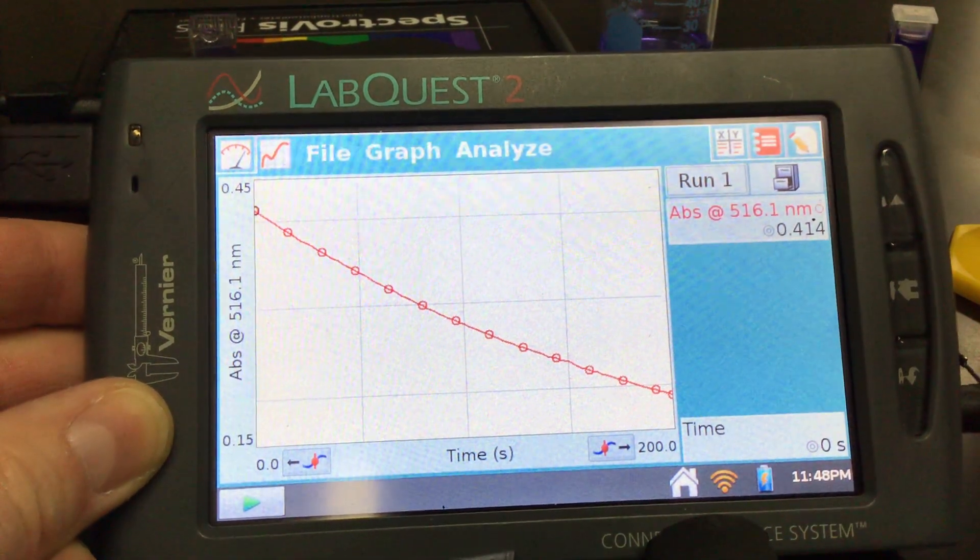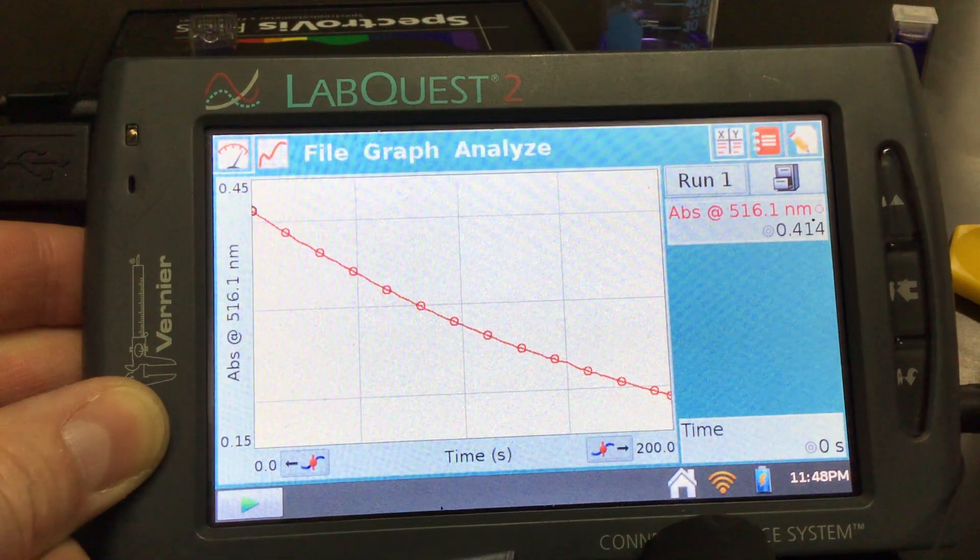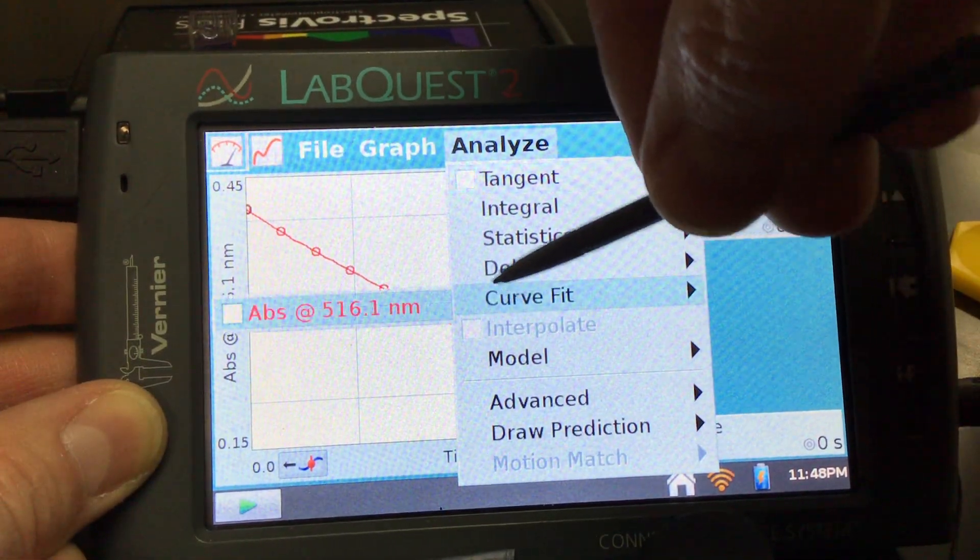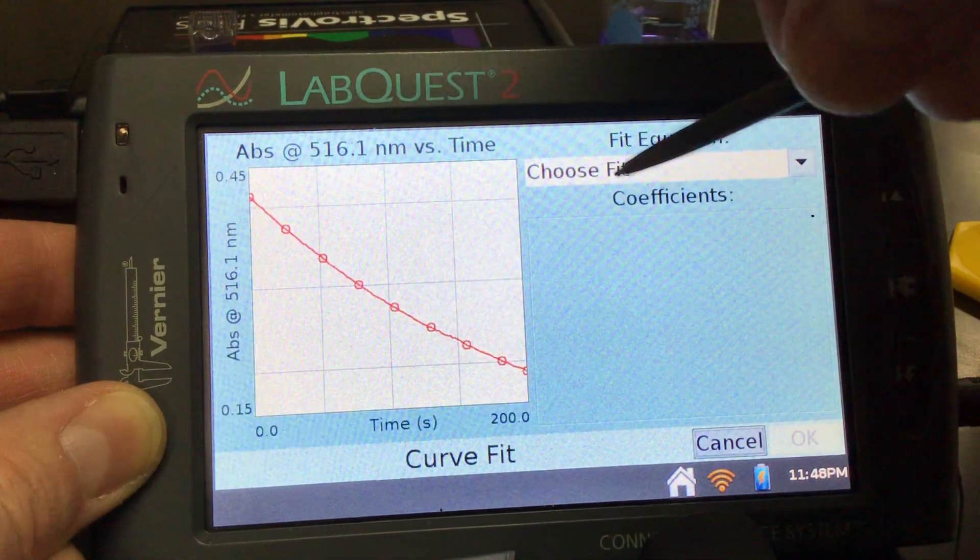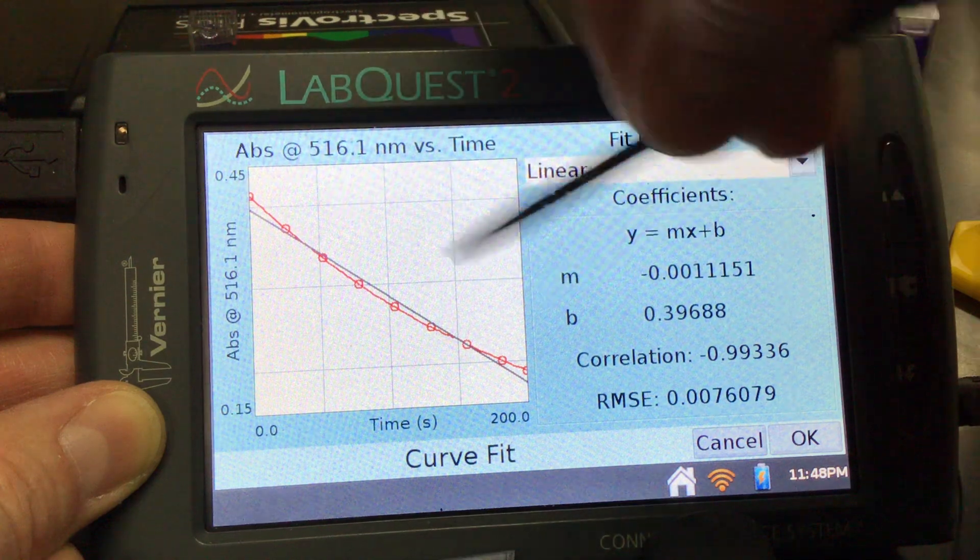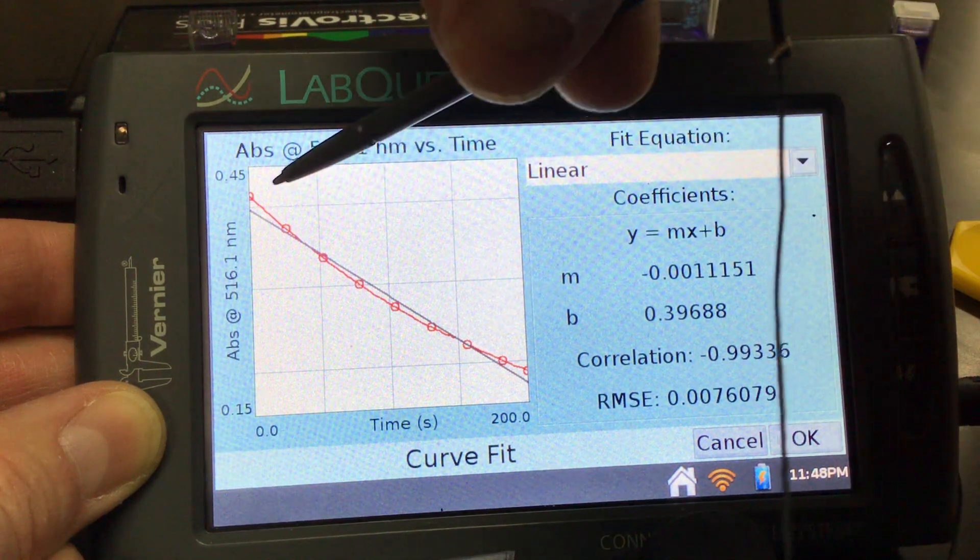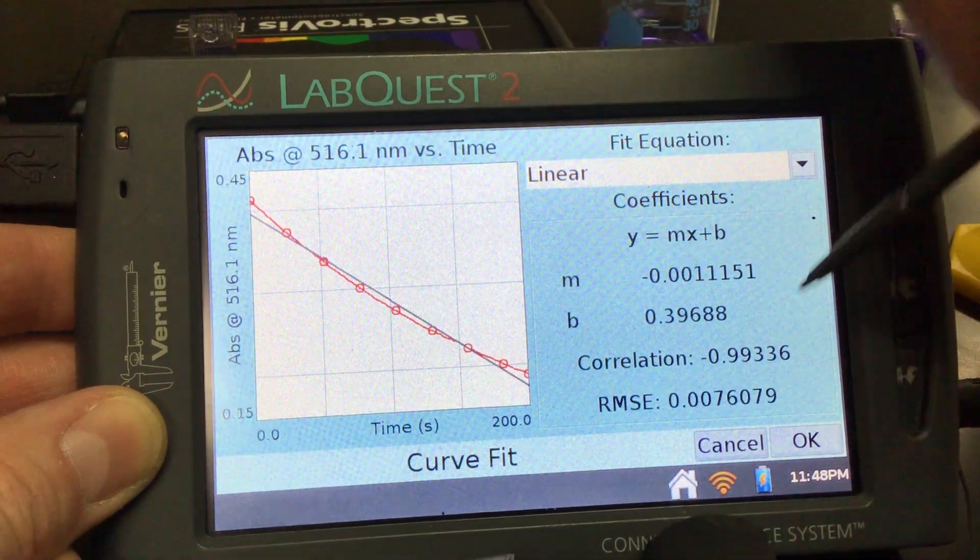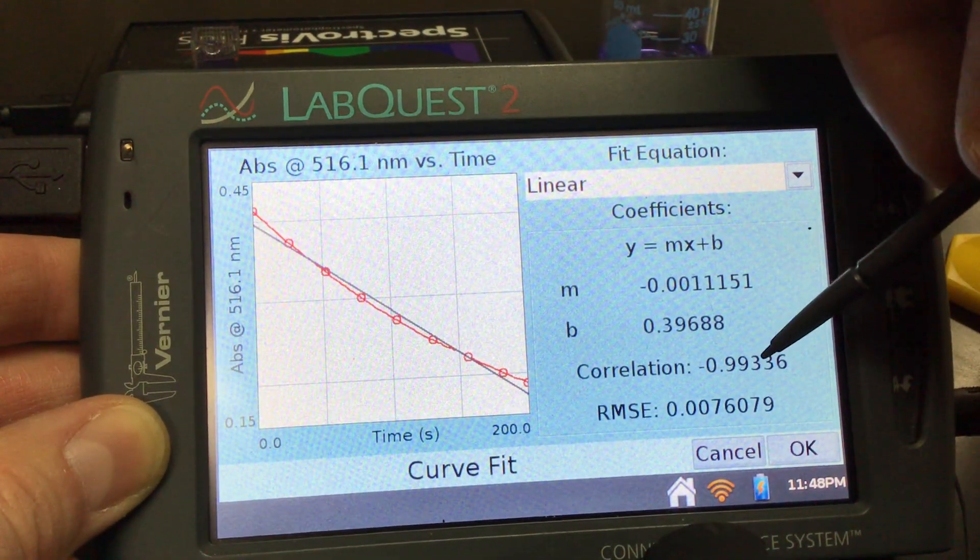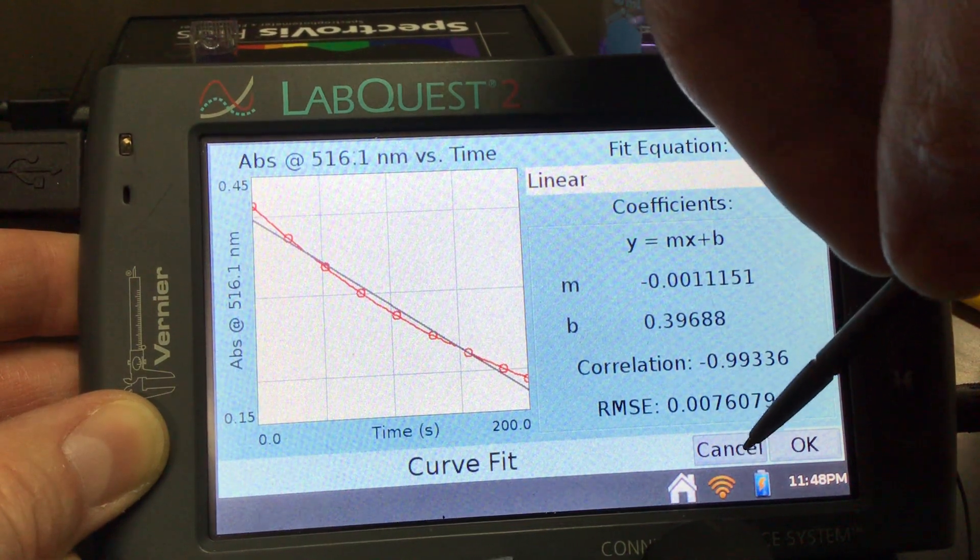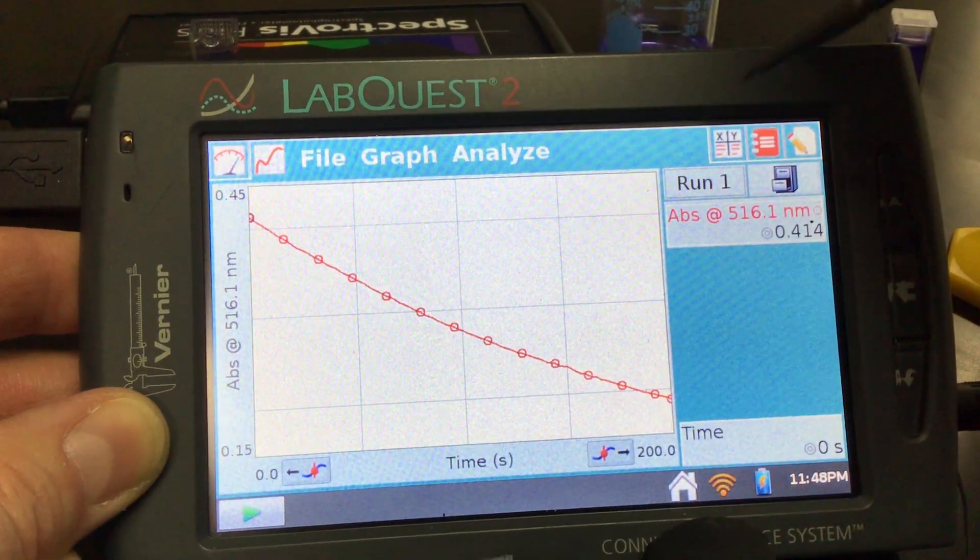We could always test that. We could analyze it and look at... if we go under analyze, curve fit, and select the absorbance and choose a linear fit, you can tell really that the line doesn't match the curve of our data. Our correlation is decent but it's not great. Let's go ahead and cancel that. I don't think that's the relationship.